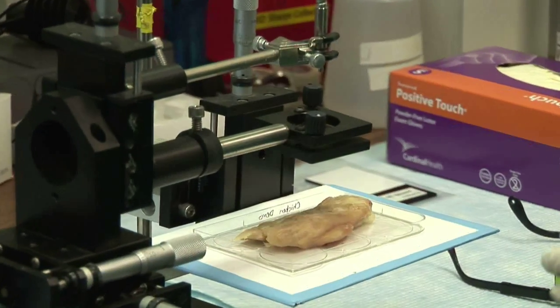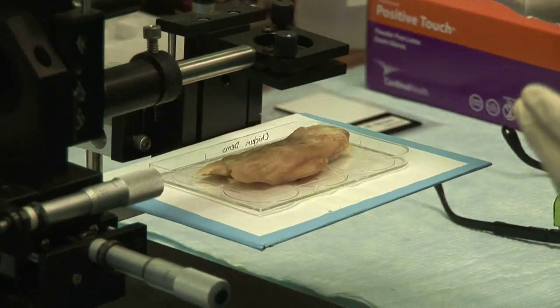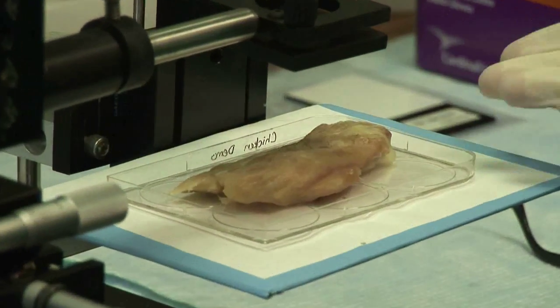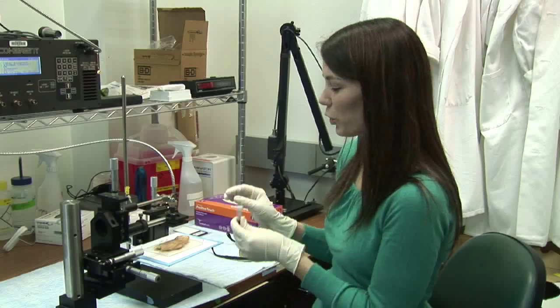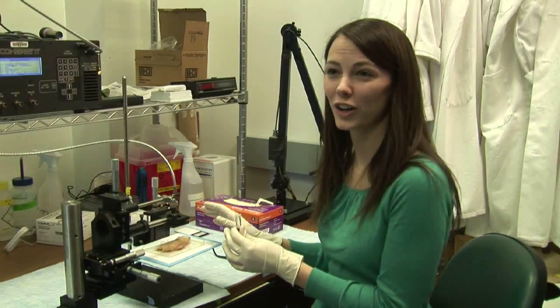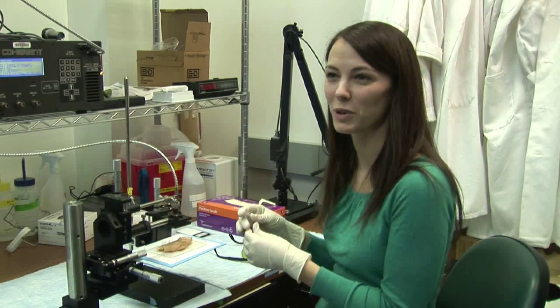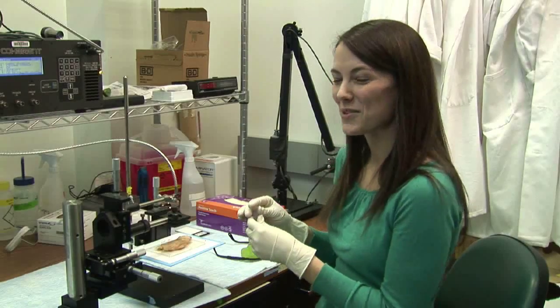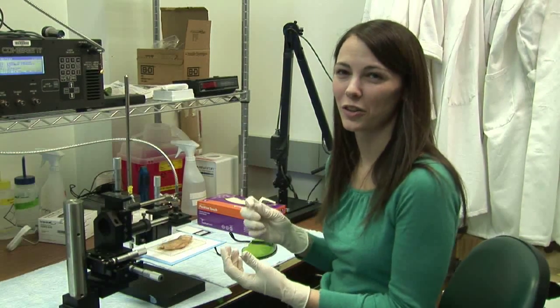First, I'm going to turn on the laser and let it run for about 30 seconds, and you'll see that nothing is going to happen to the tissue — this wavelength of light is completely harmless all on its own. What you'll see later is actually much hotter than what we would actually let happen in people; we're not actually going to start cooking people to the point where they're smoking. But it demonstrates the idea of how nanoshell therapy works.